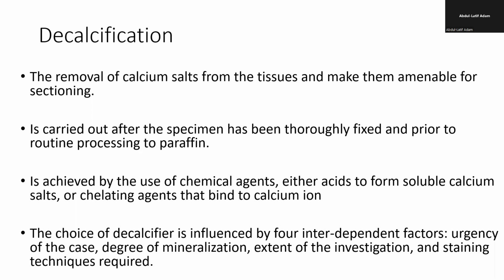Okay. So decalcification is done after you have fixation. So you don't start decalcification just from the site where the tissue is taken out of the body. You use decalcification agents as you go along.